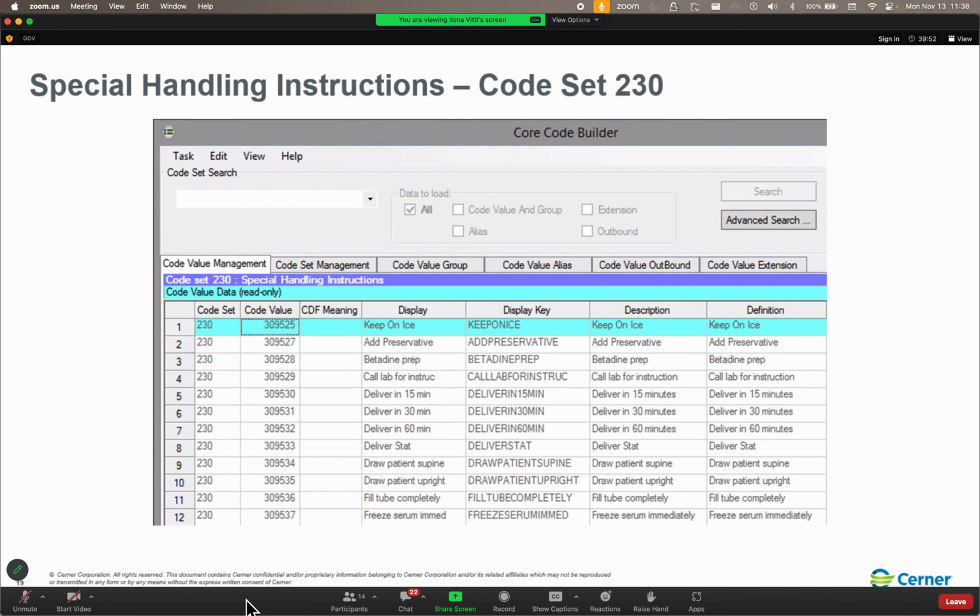Just know, because in Bedrock, you go in and define the collection class. We're missing all of those settings. We're missing the max class volume, the max accession size. Oh, absolutely, there it is.